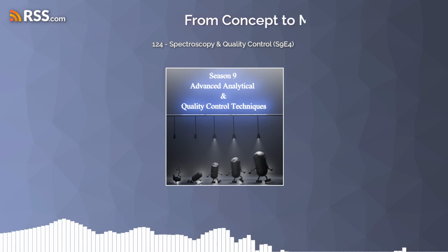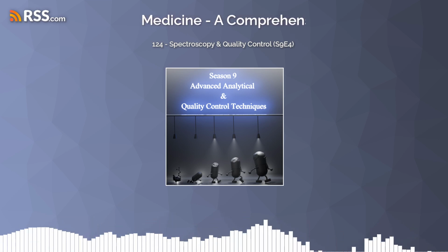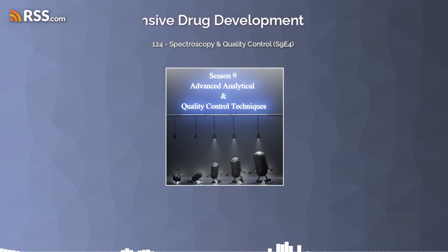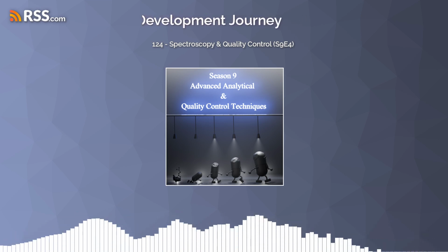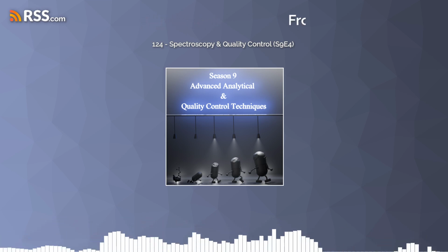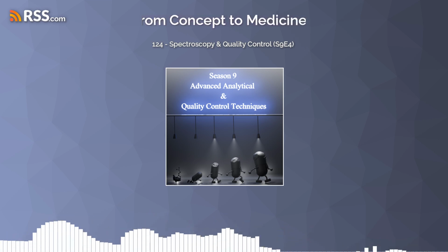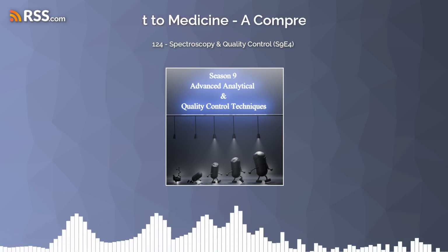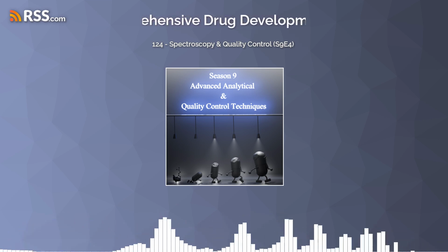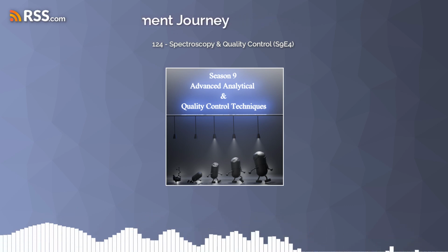So Raman spectroscopy actually looks at the scattering of light. So not absorption, but scattering. Right. And specifically, it looks at inelastic scattering. Okay. So when light interacts with a molecule, most of it is going to scatter off with the same energy that it had when it went in. Right. But a small fraction will be scattered inelastically, meaning it loses or gains a little bit of energy. So its wavelength changes slightly. And we call that change in wavelength the Raman shift. And that gives us information about the molecule's vibrational modes.